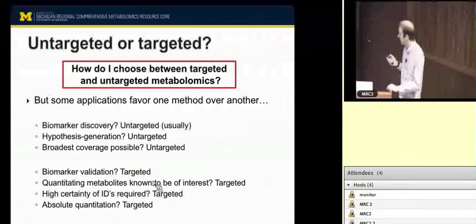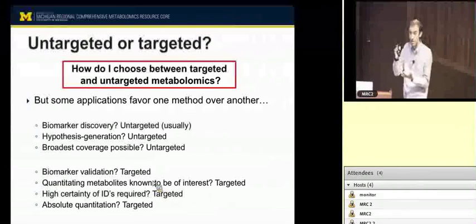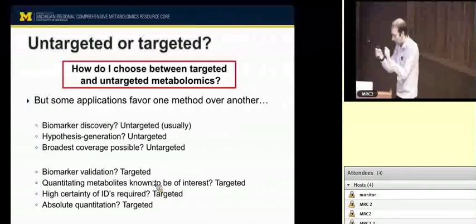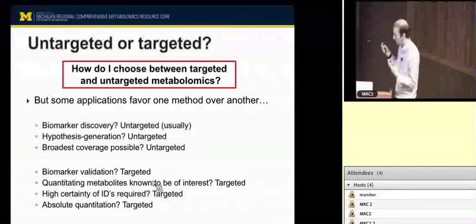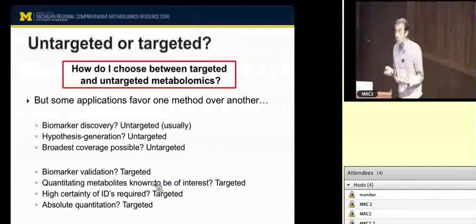A lot of the times, you'll be able to use other data in your study to help you in this process of identifying your metabolites. Or you'll be able to narrow something down to a class. You might say, okay, I have a phospholipid. It looks like it has this chain length, and it's of this class. That's good enough. I may not need to go and identify exactly where my double bonds are in that species, and you'll get fairly far. So this is to make you aware that there are these complexities of untargeted data analysis, but we're here to help you manage those complexities.